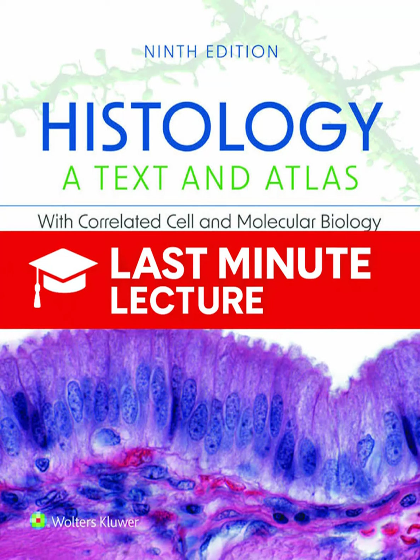And it's important to remember, while the eyepiece, the ocular lens, magnifies the image, it does not increase the resolution. Resolution is fundamentally determined by the objective lens and the wavelength of light you're using. And how you align the illumination. And proper illumination alignment, yes.